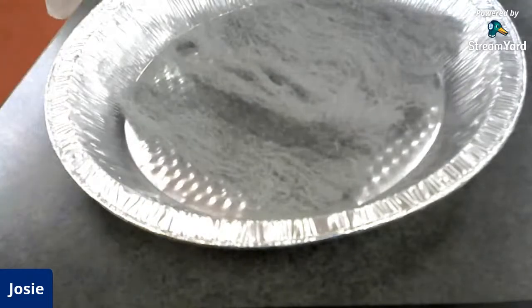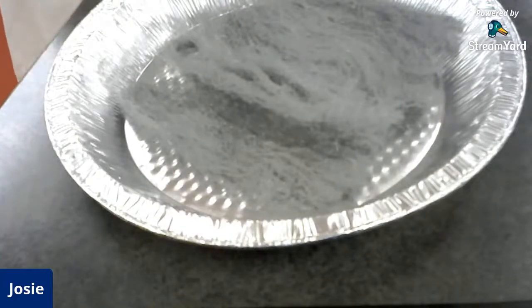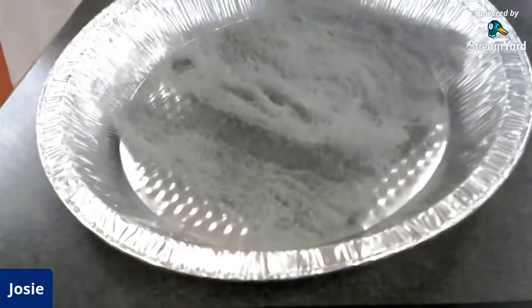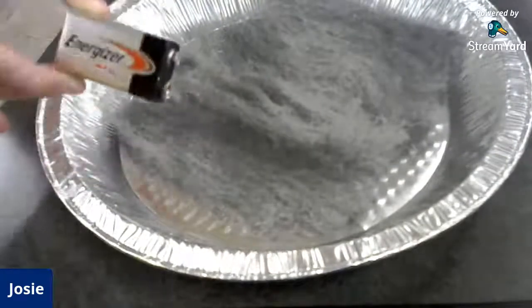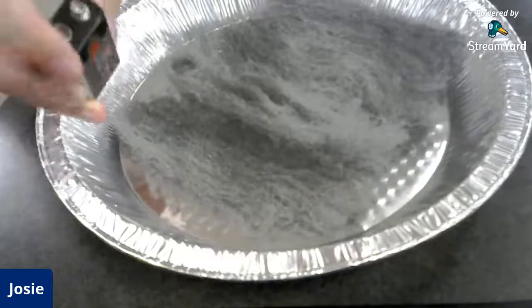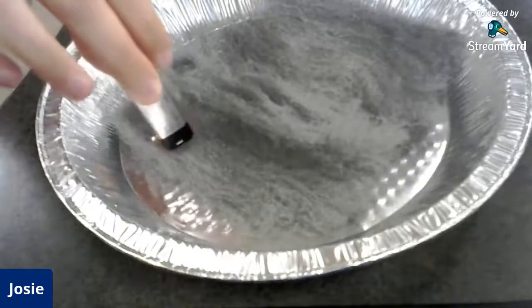I don't need gloves on right now because I'm not actually going to touch the steel wool, but when I do it a second time, I will have to put them on. So I'm just going to take a 9-volt battery, just a regular battery here, and all I have to do is touch the steel wool with it.